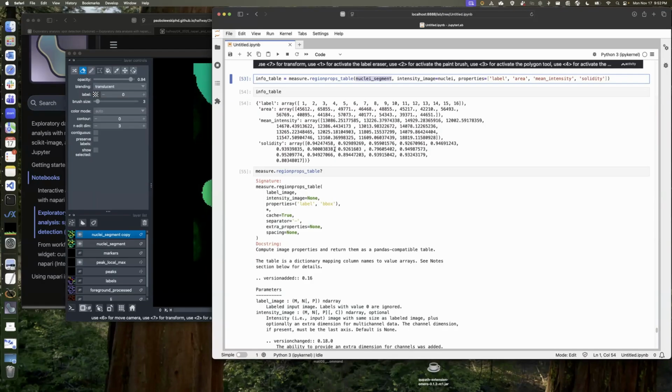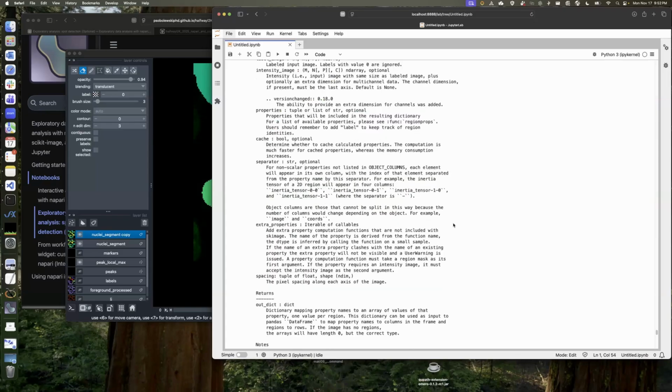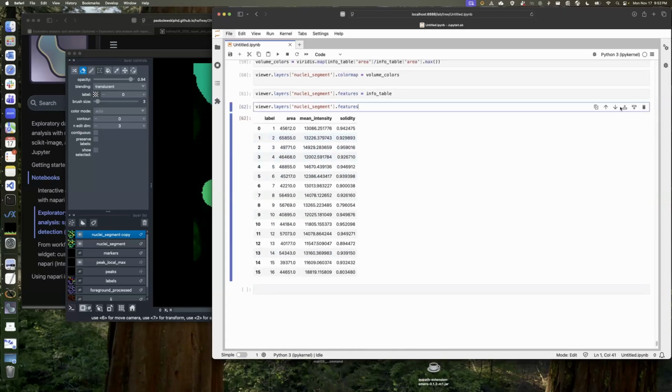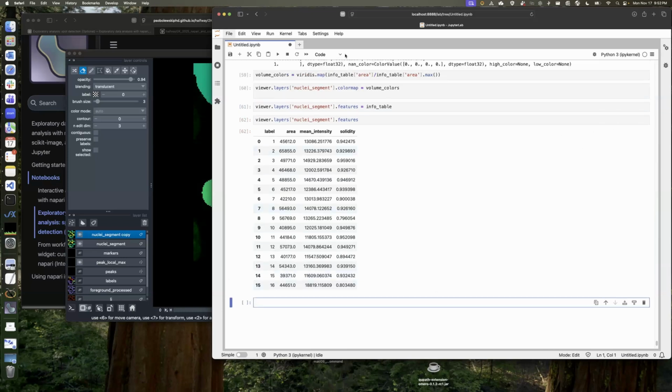Fiji is great. I use it, and a lot of people at my work use it. I just find this ability to use the notebooks great, where we could create a notebook cell here, and we could say markdown, and say we did a nice job, and then you can go back to this notebook and you'll have all those answers in it.